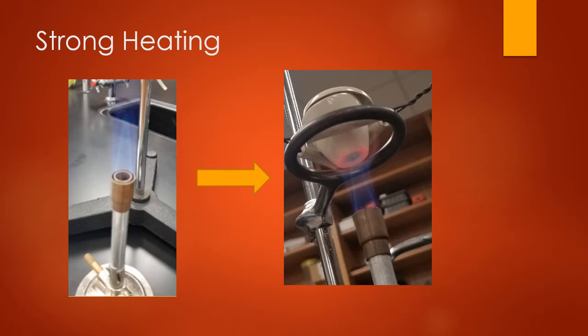Next, we need to strongly heat it. In order to strongly heat it, we light our Bunsen burner and we want to have a blue flame. You can see the blue flame to the left, and what we're looking for is this inner cone. You can see the outline of this cone. That's the hottest part of the flame. So we want to heat the crucible to get that blue cone very, very close to the bottom, but not necessarily touching. We're not looking for a red flame, blue flame's hotter. You can see in the picture to the right, once I started heating it, we heat it so strongly that the bottom of that crucible turns red.